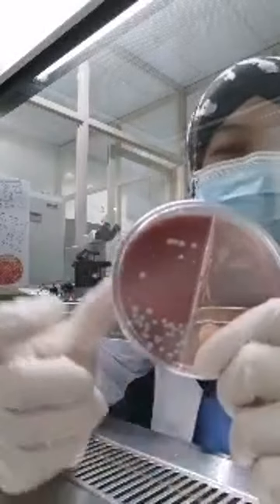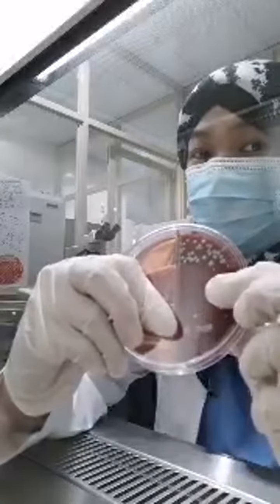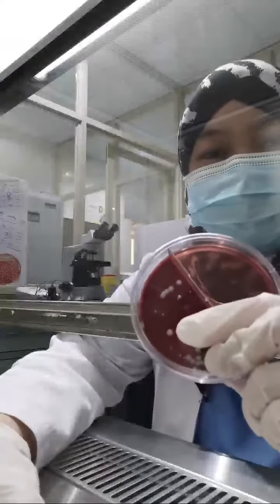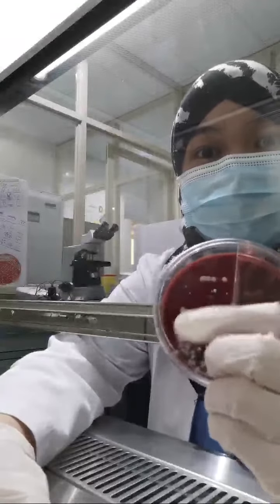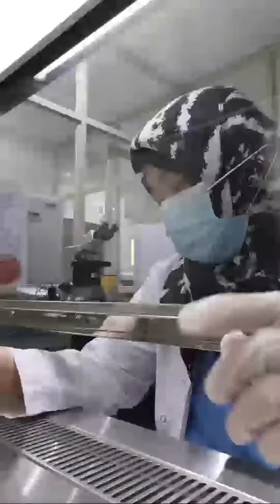So, for the blood agar, there is a growth. So let's check, so that you will know what colony this is, so you can identify. I already did, and it is Staphylococcus.